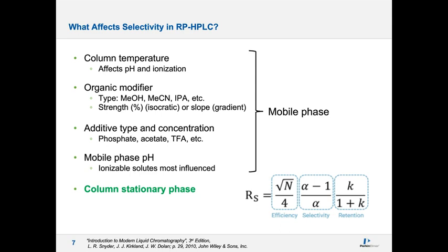Initial screening of columns containing different bonded phases under the same mobile phase conditions can help achieve the desired separation more quickly, therefore increasing productivity. It is, however, important to define the scope and the attributes of the methods being developed to carry out the appropriate screening methods and also know when to stop optimization.